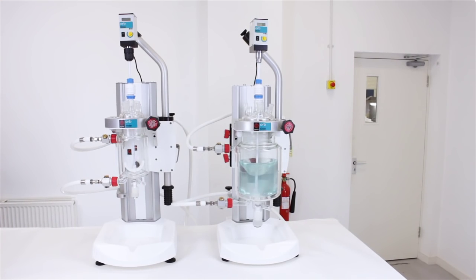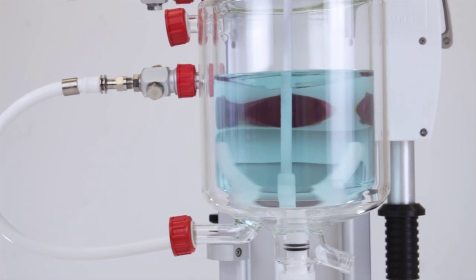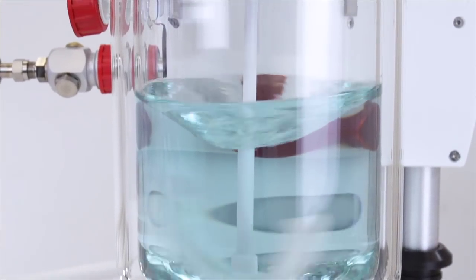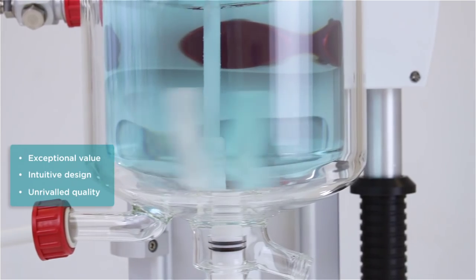Orb is a compact, benchtop, jacketed reactor system from Cirrus. With a wide range of accessories, stirrers, stirrer motors, circulators and reactor profiles, with volumes from 100 ml to 10 litres, it offers excellent value.